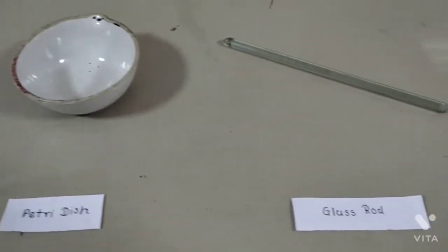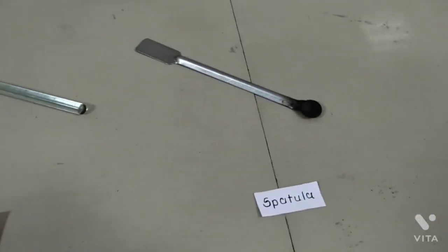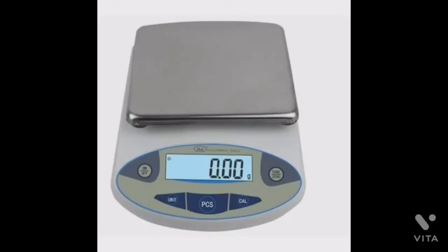Let's see the apparatus used in the preparation. We are going to use petri dish or mortar, glass rod and spatula. And for weighing of chemicals we are going to use a weighing balance.